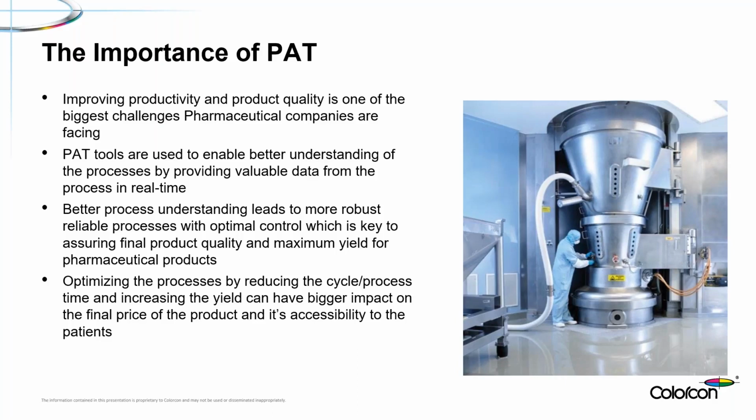And that's where PAT comes in, with the ability to measure things like particle size in line in real time and moisture content as well. So the ability to monitor these, not just at the start of the process, but throughout, lets us adapt our process inputs rather than keeping them as rigid. We can adapt them to ensure the best possible critical quality attributes of our finished materials.